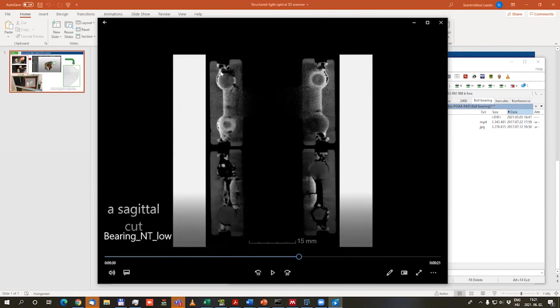Here you see in the top view, where the new item is shown, these white areas, which is the lubricant, the grease, and it's distributed all over. In the bottom region, you see many cracks already, and much fewer places where this grease is present.